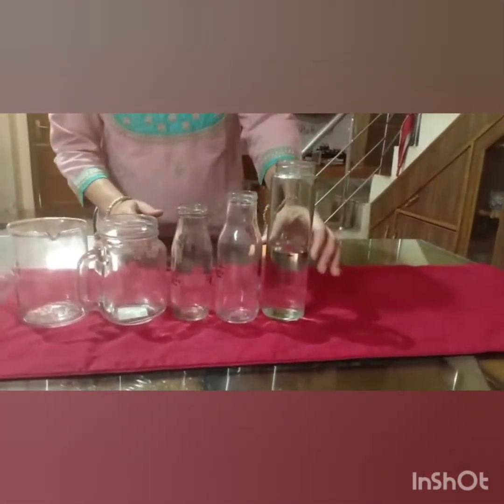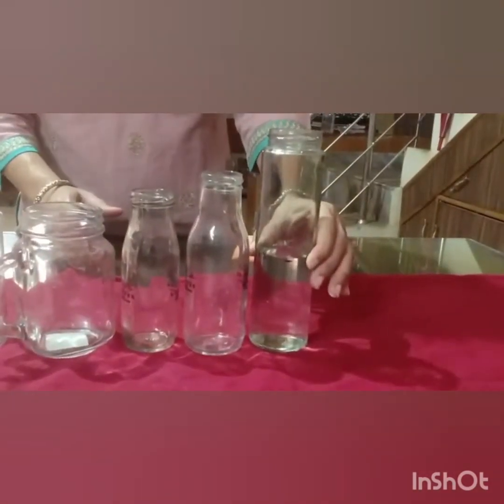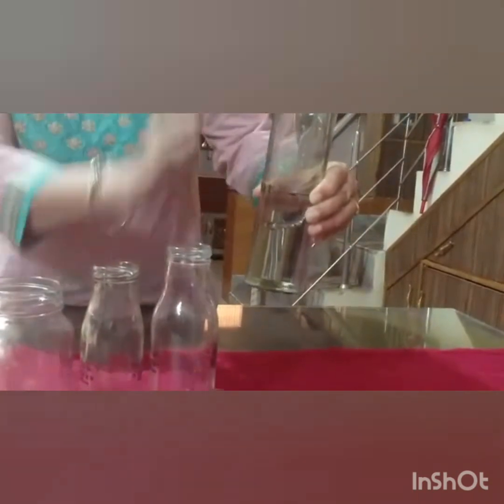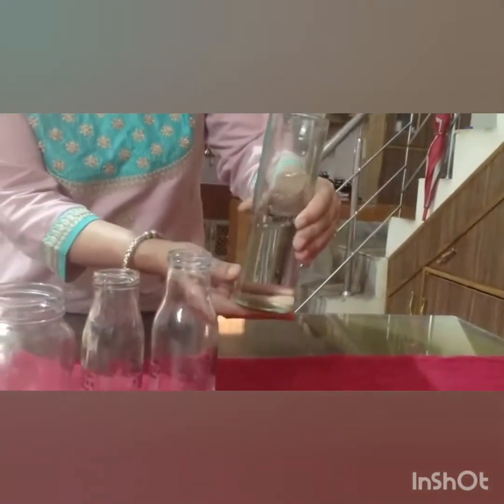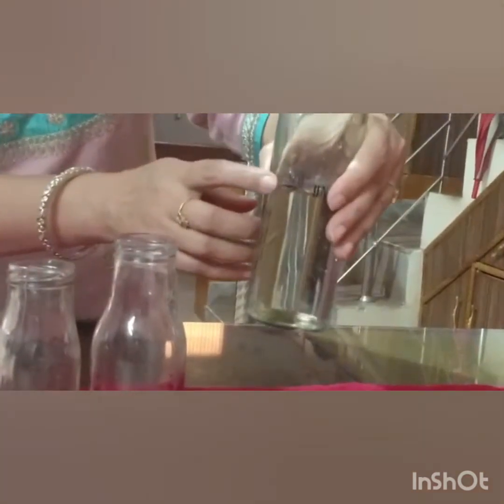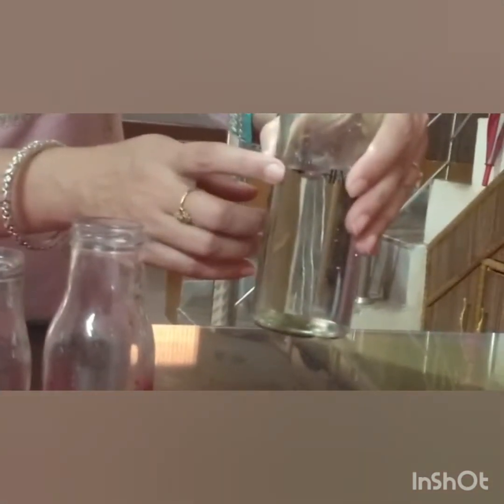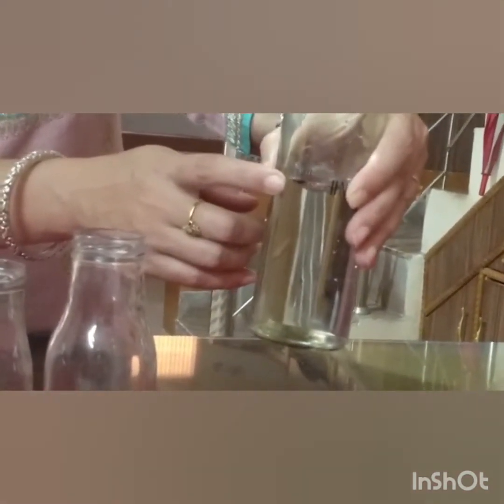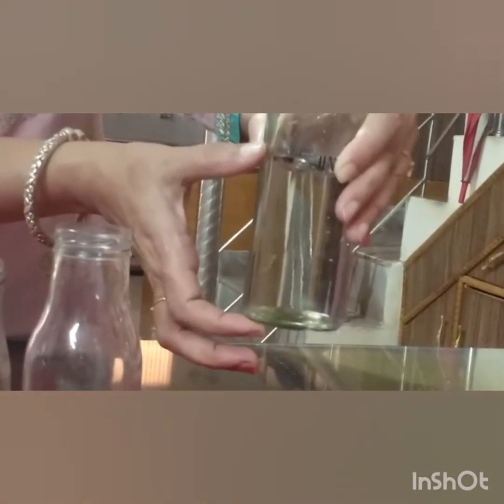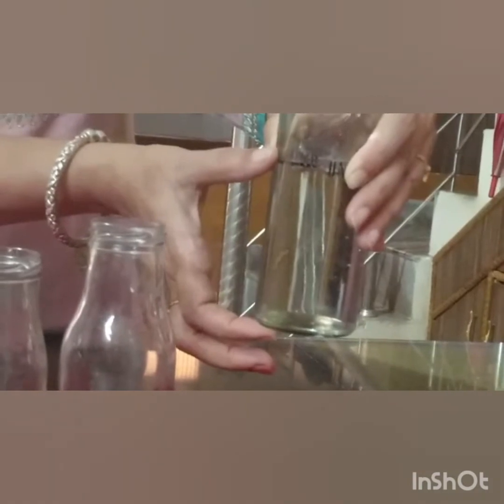So first I'll measure 100 ml of water in the measuring cylinder. So this is my measuring cylinder at home, so I'm using this. So I have made a mark here that I have this volume of water. This black mark shows that I have this much volume in this measuring cylinder.